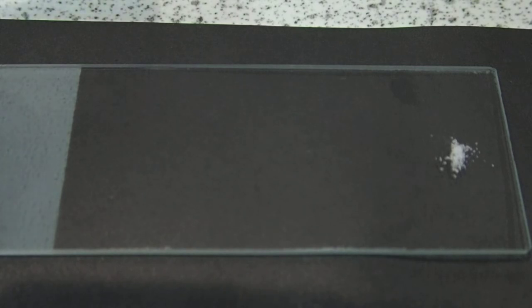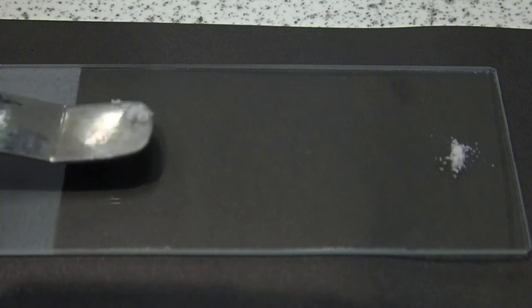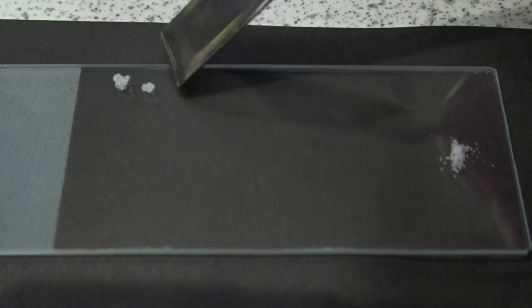First put on the lead nitrate, here's the potassium iodide, trying to get this slightly towards the top of the slide, and now push it together with the spatula.